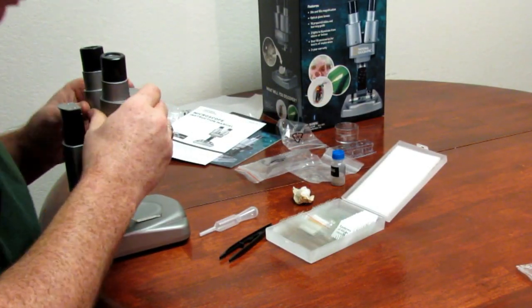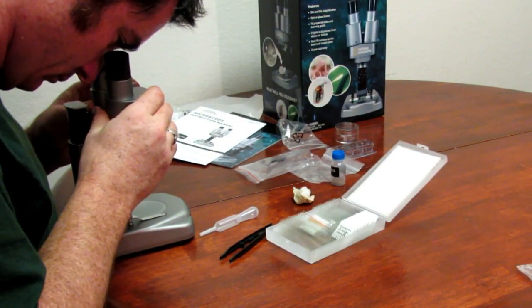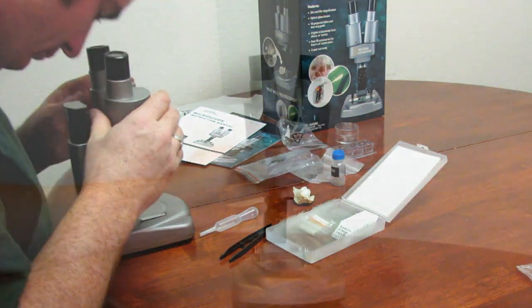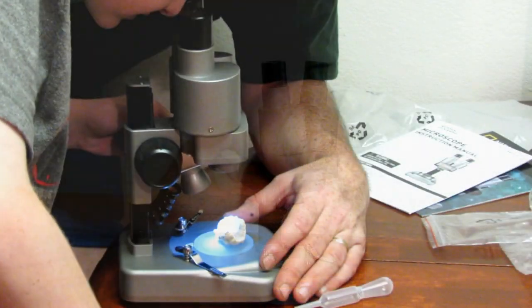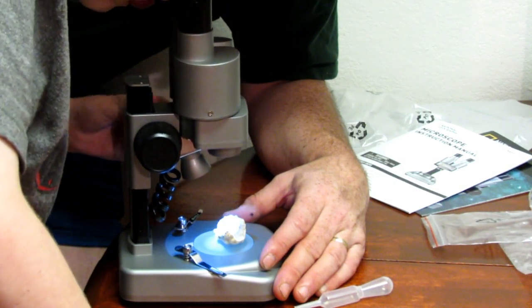Being a dual microscope, this does not have a diopter adjustment. You are able to adjust the coarse focus, which is this main knob here.